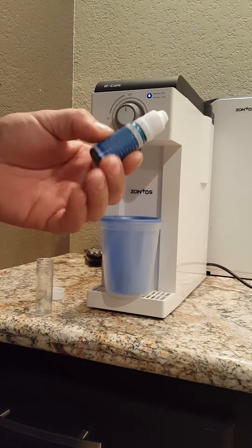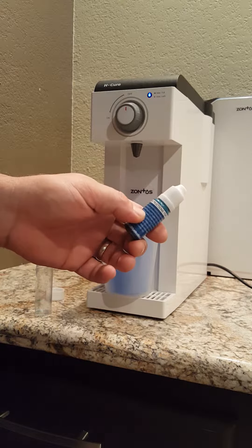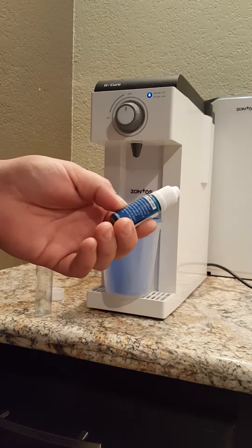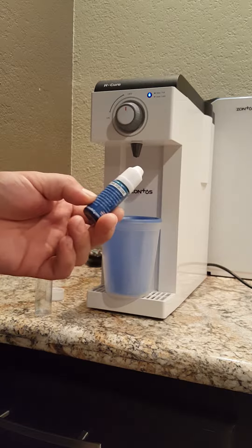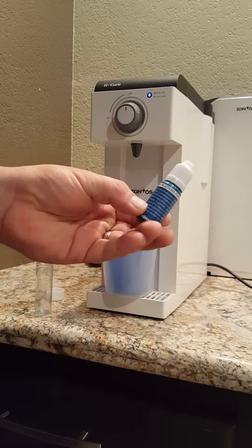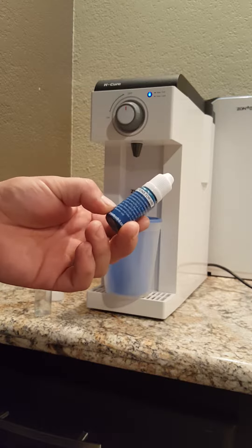Fill the beaker with hydrogen water to 6 milliliters. Add drops until the water remains blue. Each drop of H2 Blue equals 0.1 ppm of H2. For example, 10 drops equals 1 part per million of H2.